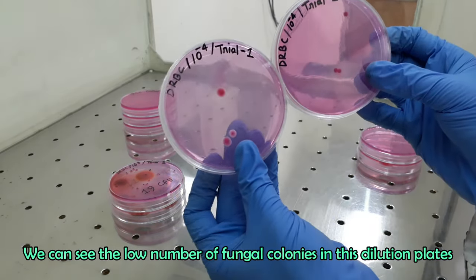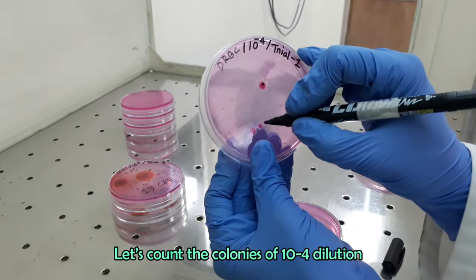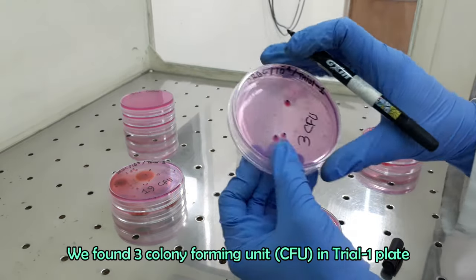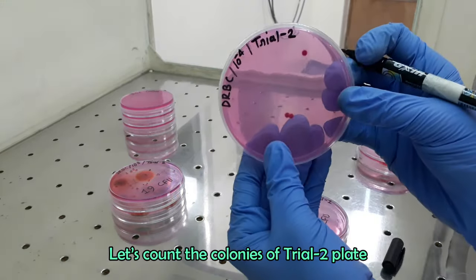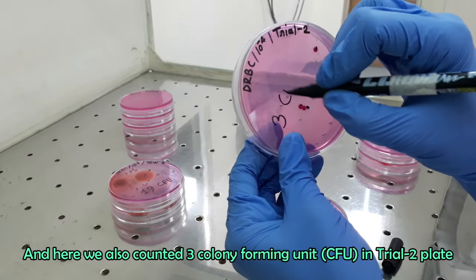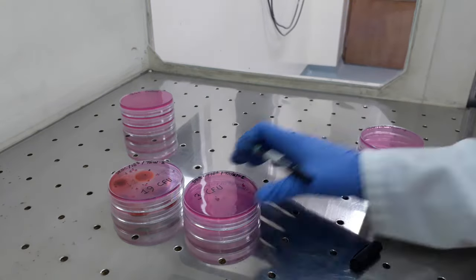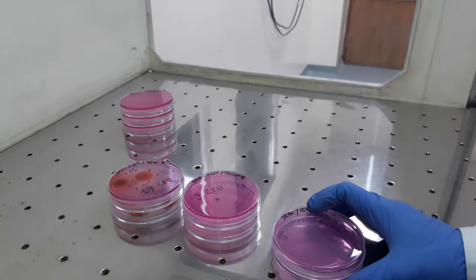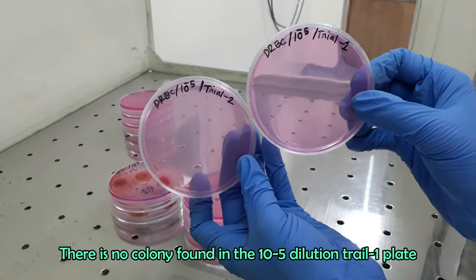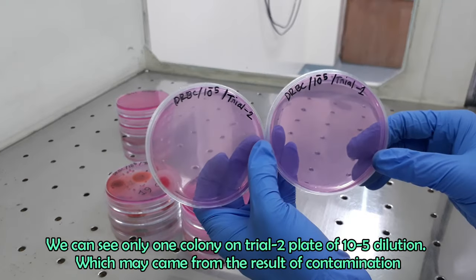We can see the lowest number of colonies in 10 inverse 4 dilution plates. Let's count the colonies of 10 inverse 4 dilution. We found 3 colony forming units in both trial 1 and trial 2 plates. We can see only 1 colony on trial 2 plate of 10 inverse 5 dilution, which may have come from contamination.